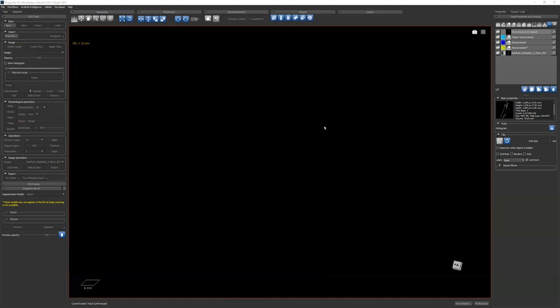the reason why we have this rectangle is because it's oblique. I'm not 100% sure of that actually, because it doesn't seem like it was this oblique. This almost seems like a sagittal. But you will always get, in the sagittal section, kind of a long rectangle rather than square. Exactly. But what you normally see with TIF stacks is the square, because it's a cross section. Transverse, yeah. So I'm wondering if this is not some mistake.